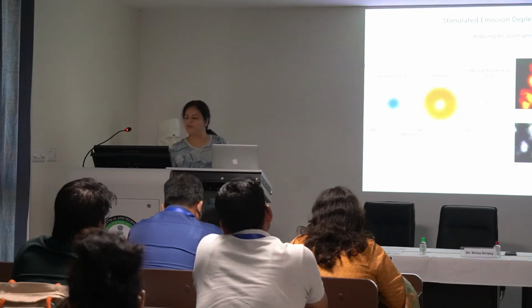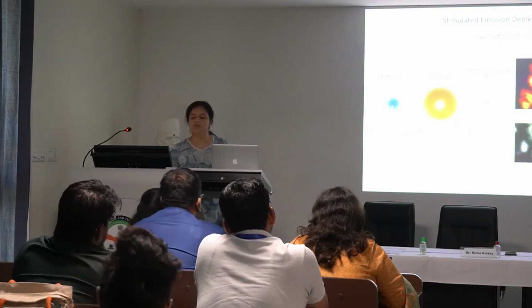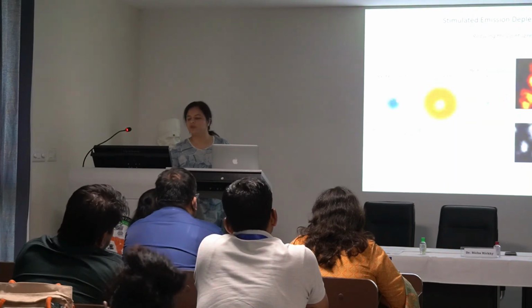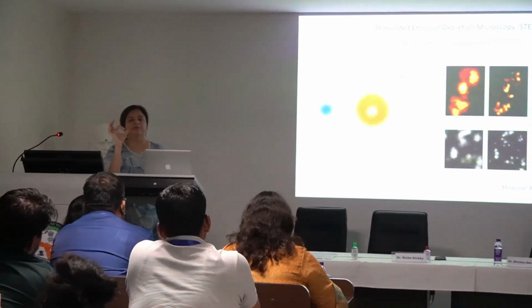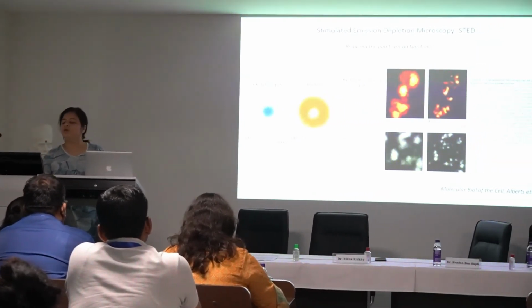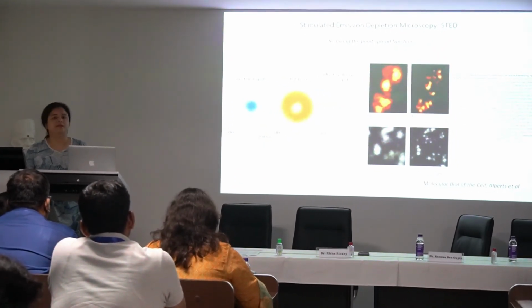What's happening here is that typically you will have an excitation spot which gives rise to fluorescence such that it gives rise to a big diffraction limited spot, right? So can we, for example, just excite very less, right?